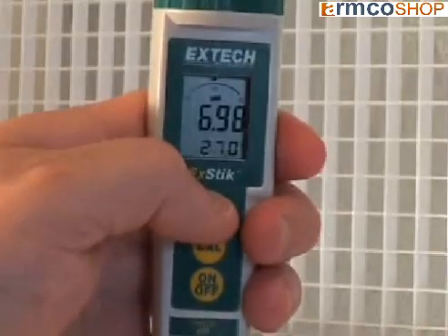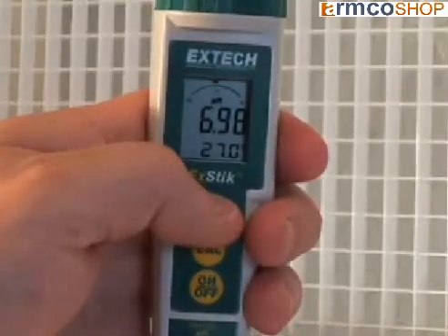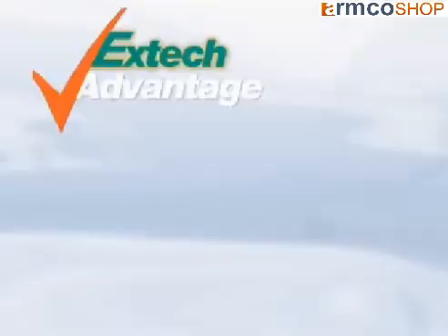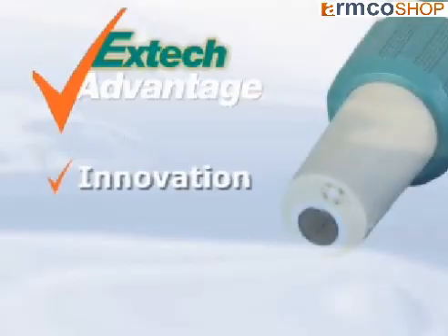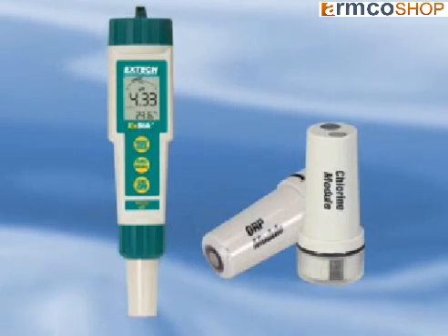This feature eliminates the need to bring samples back to the lab. It not only saves time, but provides maximum accuracy for on-the-spot data recording. X-DIC stresses on innovation to help you solve your day-to-day problems by using the latest technology. The X-DIC pH meters are also designed to measure chlorine and ORP by changing the electrode module.